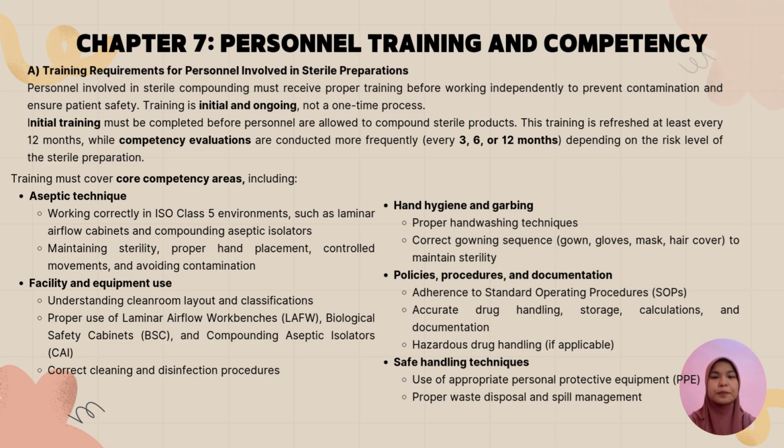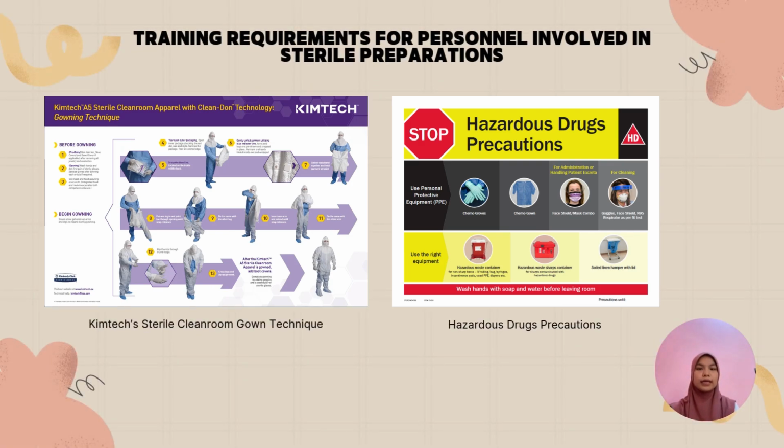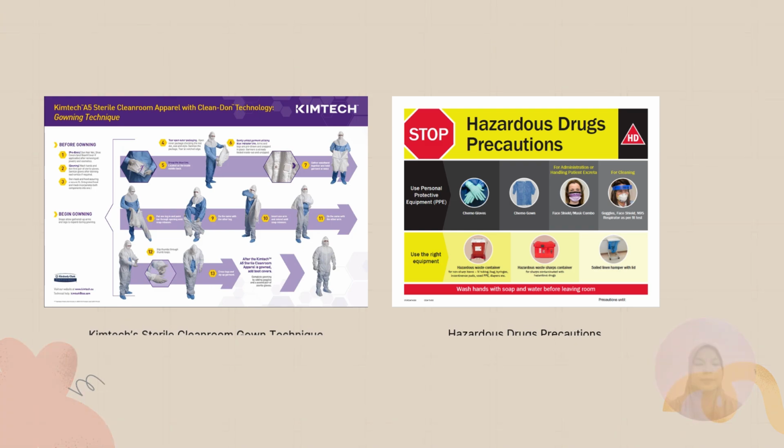spill management. This slide shows the Kimtech apparel gowning techniques step by step, and also the hazardous drug precautions room sign, which shows the personal protective equipment (PPE) that should be learned by the personnel.